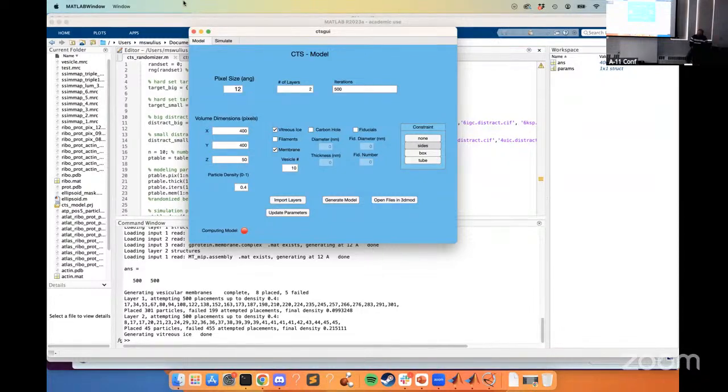Theoretically, could you use the segmentation you give to another model with a different one you have in Dragonfly? I think so, for sure. There's no reason, though they would need to have the same number of classes. If you have a 5-class network and a 4-class network, they just don't jive. You could erase one of the classes and force it to work. There are ways to get around it, but I don't see why not.